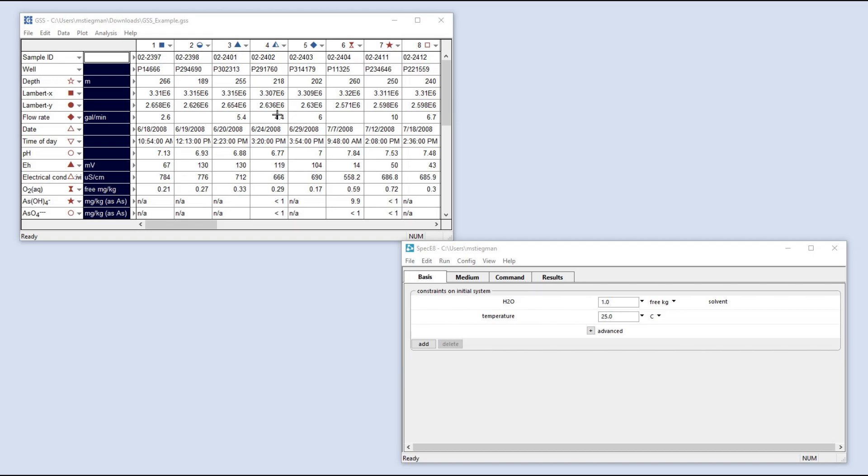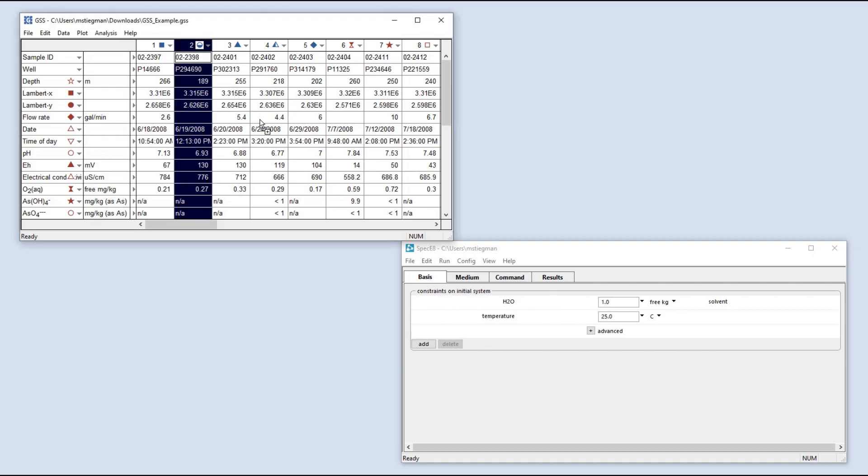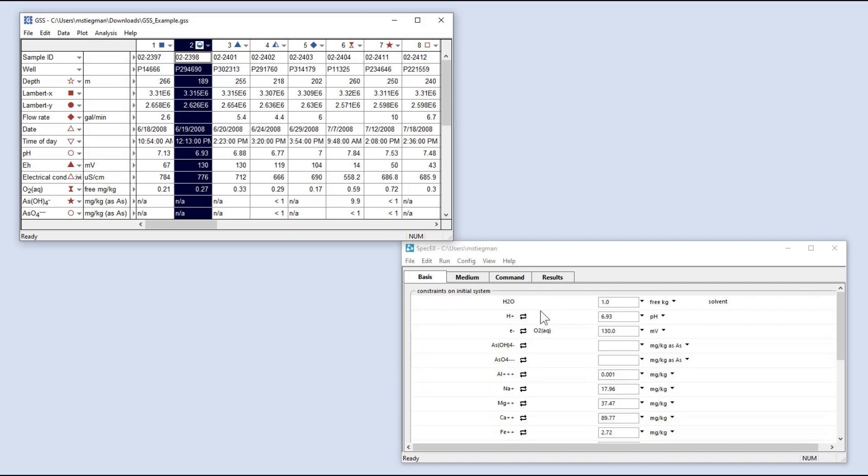Here, I am moving a sample from a GSS spreadsheet into Speciate. From the sample header, right-drag the sample into the other application.